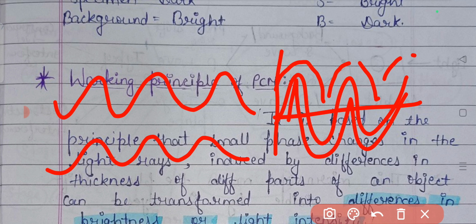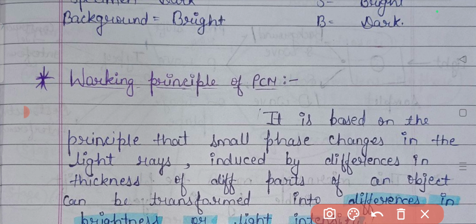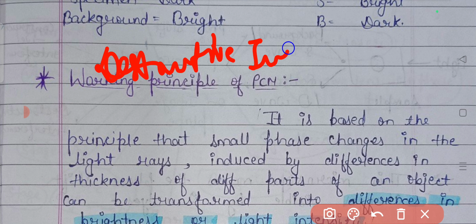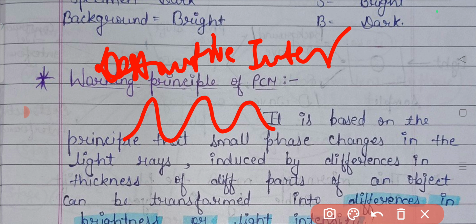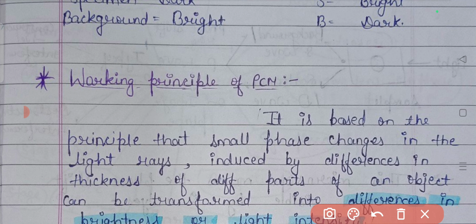This type of interference of waves is known as constructive interference. So here we will be seeing a clear and contrasted image. Another type of interference that is present is known as destructive interference. Basically, in case of destructive interference, one wave is normal and the second one is quite different, so that the clear and contrasted interference is not present here. As a result, a clear image is not formed and we will not be seeing any kind of image.